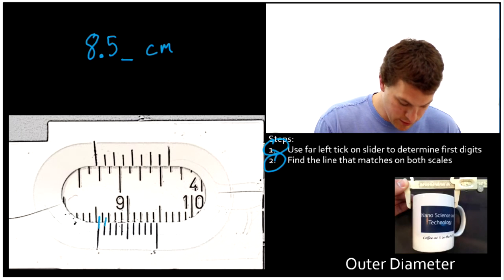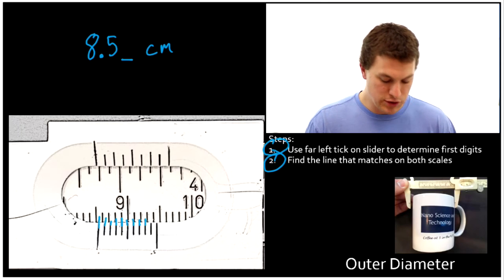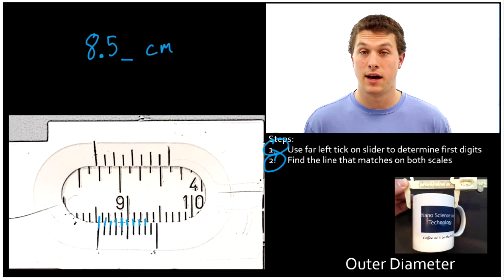That one's getting close, even closer. That one looks pretty dead on. That one looks a little off to the left, a little off to the left, more off to the left, off to the left. So you can see that only one of those actually lines up directly.